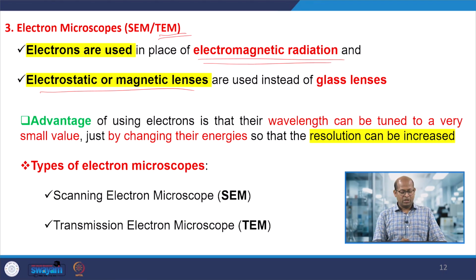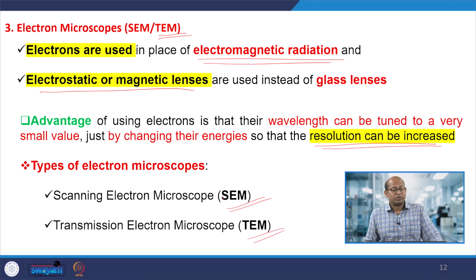In this type of electron microscopy we get better resolution of the materials, of the surface morphology of the materials we have prepared, and better structural information. So we can use SEM as an analytical or microscopic tool for the analysis or characterization of nanomaterials.